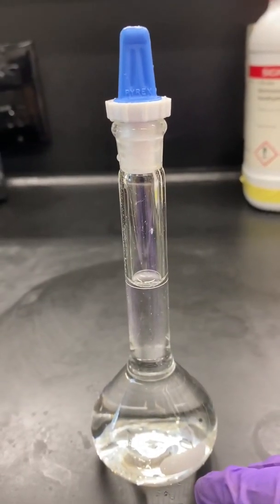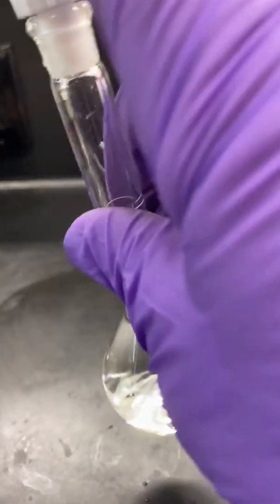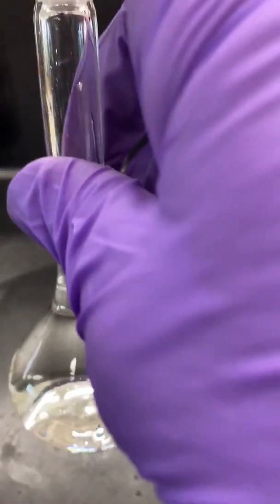Fill the 50-milliliter volumetric flask to the line with distilled water, cap, and mix well. This is what we call Stock 2.